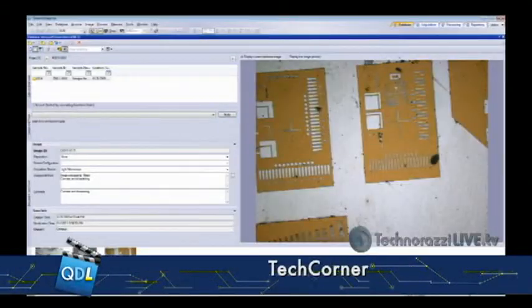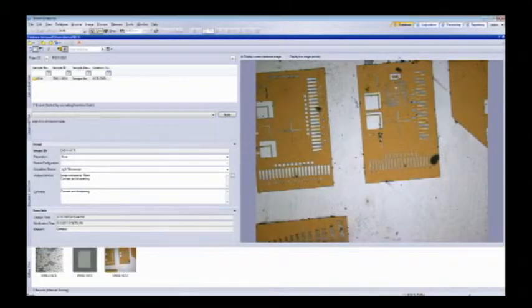So today, with the Stream 1.9 software, some of the new features: the software incorporates a very integrated database tool. There are several new features that I can't cover all of in the time we have, like copying fields and being able to paste them quickly into new inserts. The database allows archiving of your images, measurements and reports, and being able to search through them quickly later and share throughout the network of users in the company, I would imagine.